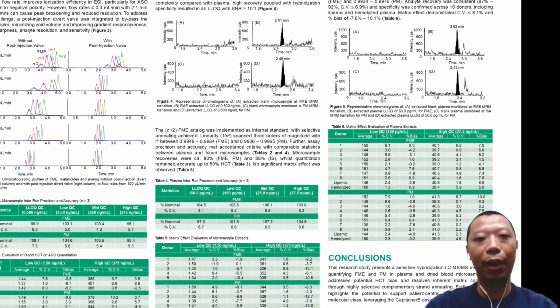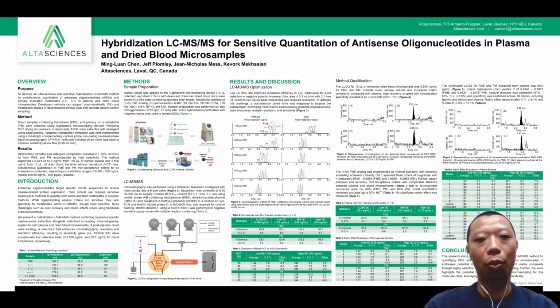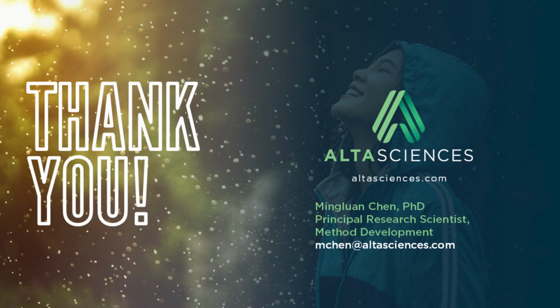In summary, our hybridization LC-MS/MS method represents a significant advancement in ASO bioanalysis by offering unmatched sensitivity, minimal sample requirements, and enhanced analytical performance. We provide practical and reliable tools for ASO PK and metabolism studies. The integration of the dry blood microsamples and the hybridization-based enrichment makes the method highly suitable for both centralized and decentralized clinical trials.